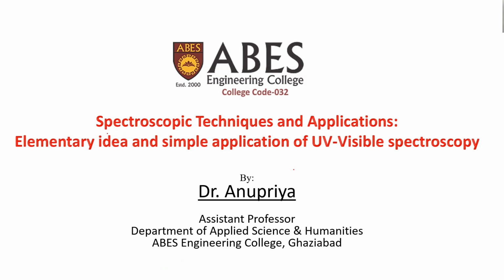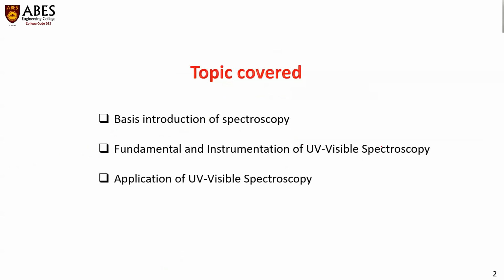In this lecture, we will discuss spectroscopic techniques and applications. Basically, we will discuss the elementary idea and simple application of UV-visible spectroscopy. The topics we are going to cover are a basic introduction of spectroscopy, fundamentals and instrumentation of UV-visible spectroscopy, and the application of UV-visible spectroscopy.